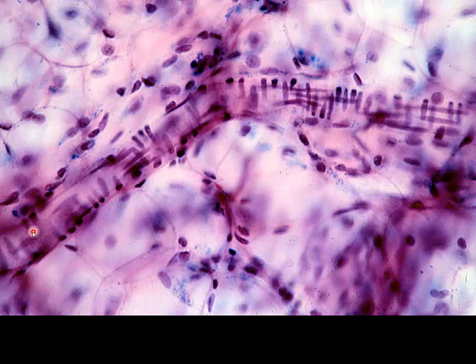here we have a small blood vessel, and in all likelihood, we can't really see the red blood cells inside, but when you see these nuclei running almost around in this direction, you can pretty much bet we're looking at the nuclei of smooth muscle cells coursing around, or possibly pericytes. It's again difficult to tell with it so transparent. And then these nuclei that are running longitudinally along, these are going to be the endothelial cell nuclei.